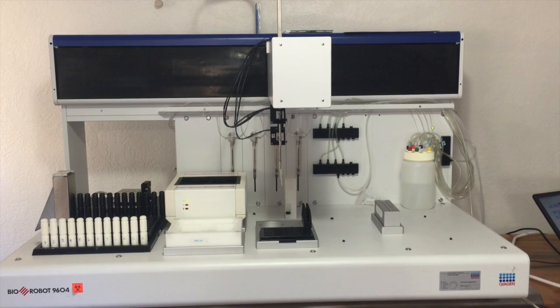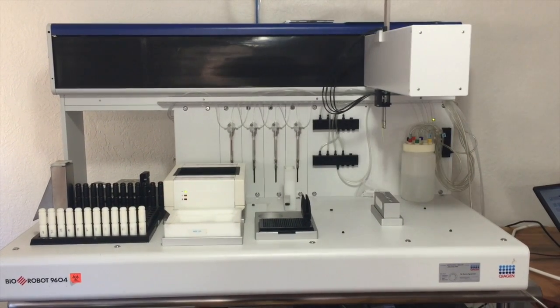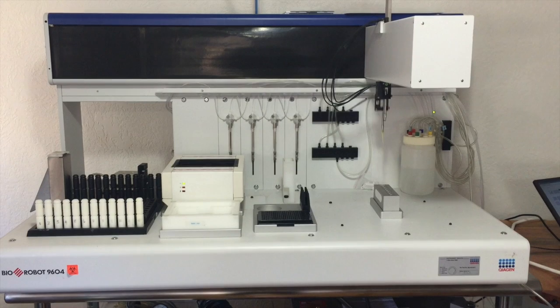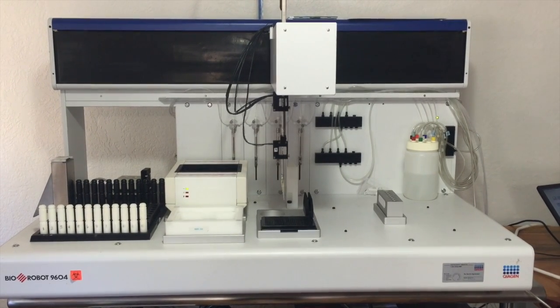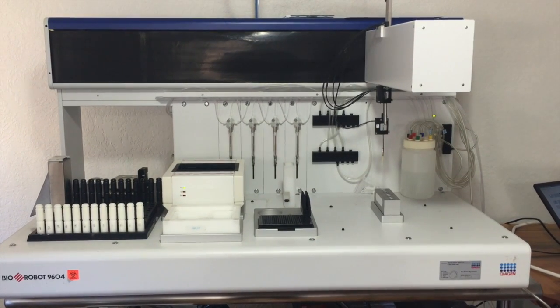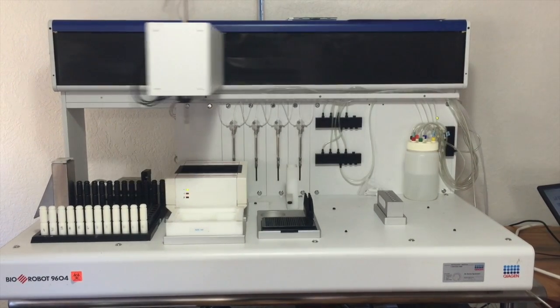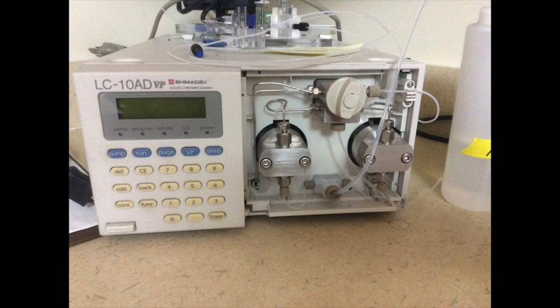Andy's curiosity got him poking around with the DNA robot. He was able to locate a friendly source of help at Qiagen that helped us find the current version of the software, configuration files, and the proper interconnects along with the developer's guide for the software. So this has resulted in making this robot now a viable resource for automating the DSMS experiments with the mass spec instrument. And Zach has been able to program the robot already to make moves that are representative of those necessary to produce the automated mass spec interface that we will need.